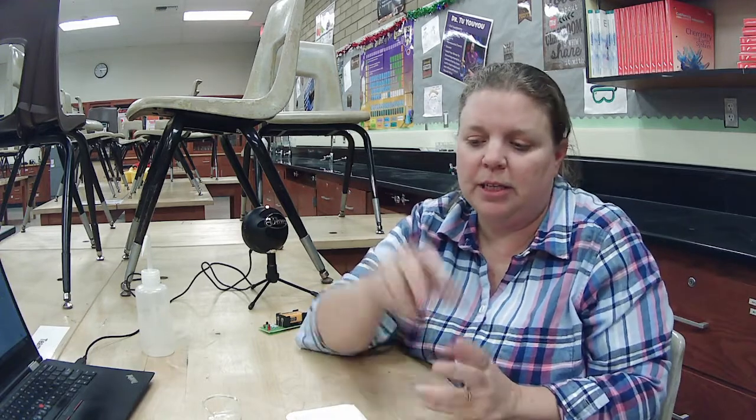All right, welcome to the Conductivity Lab. We are going to test a few things. We're just going to do a quick test. Make sure you got on Google Classroom and saw how to set up your notebook to do this. We're going to see how covalent and ionic bonds differ when we talk about conductivity. Conductivity is being able to conduct electricity.